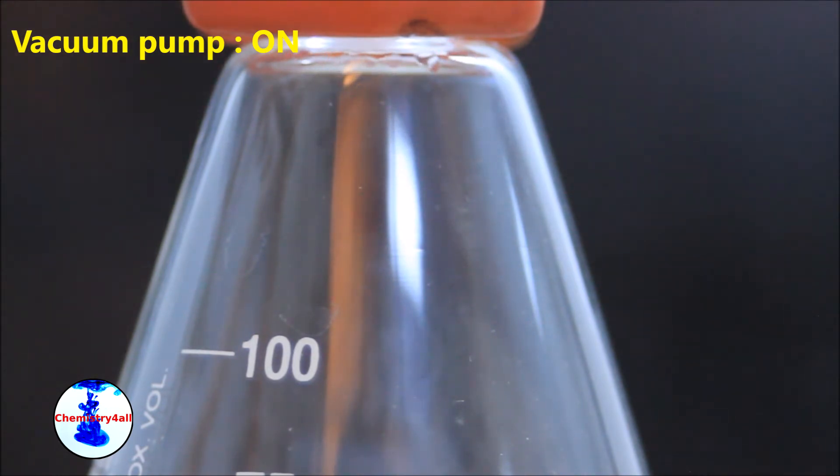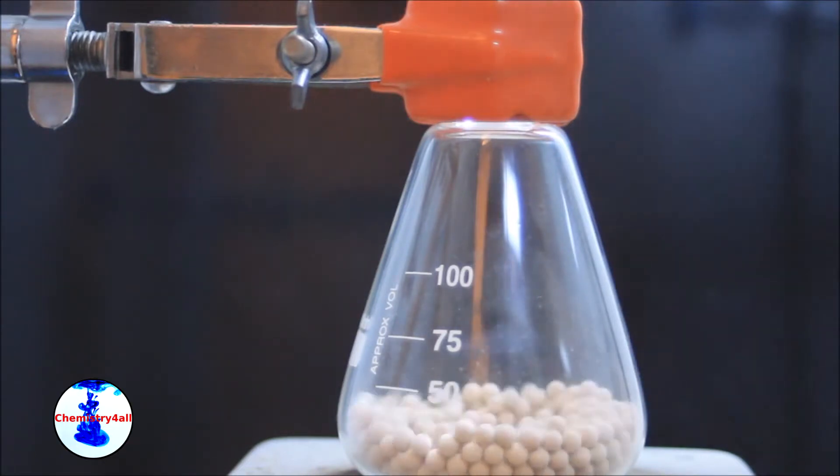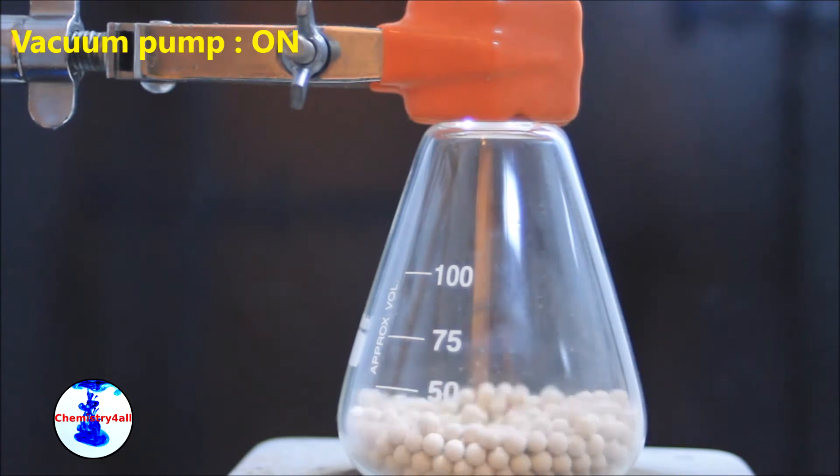Let's explain what a molecular sieve is. A molecular sieve is basically a porous clay-like material that has a very well-defined and homogeneous pore size distribution, such that it can trap molecules with an effective size smaller or equal to its pore size. This is indeed very useful as we can selectively trap molecules of a given size from a mixture or solution.